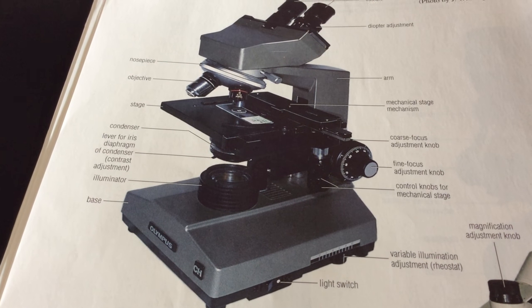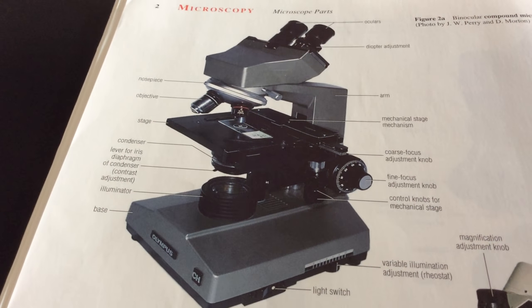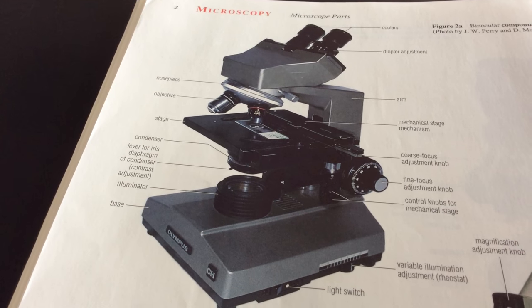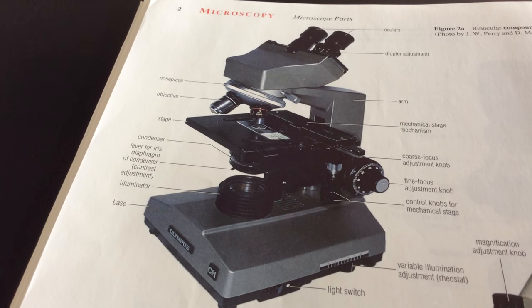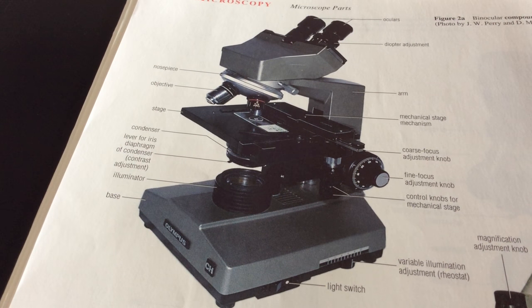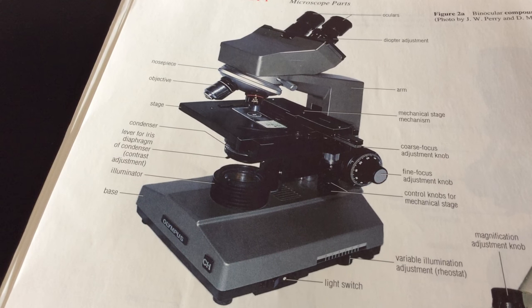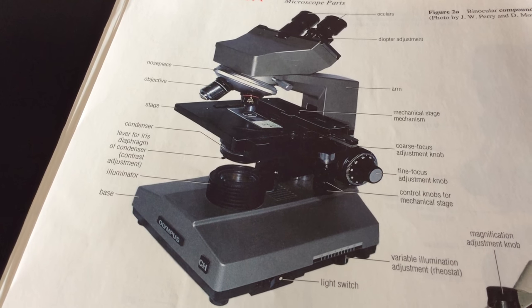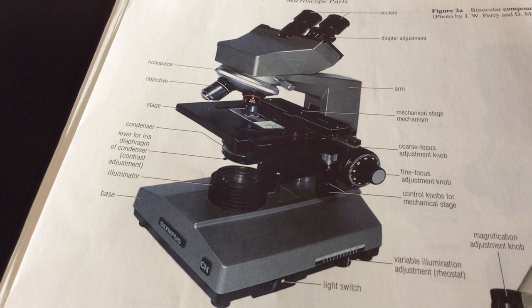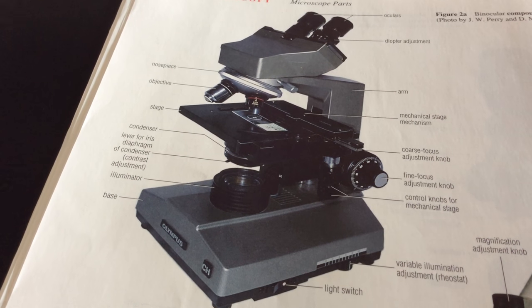Now, what we're going to do is switch over to an actual microscope. This might be one that you'll be using in the microbiology lab, or you could use a different model. This is an Olympus microscope. These microscopes were bought with money donated by Dr. George and May Kambara. Dr. George and May Kambara were students at Sacramento City College in 1935 and 1937, and they kindly donated money that bought many of the microscopes we still use here at Sacramento City College.